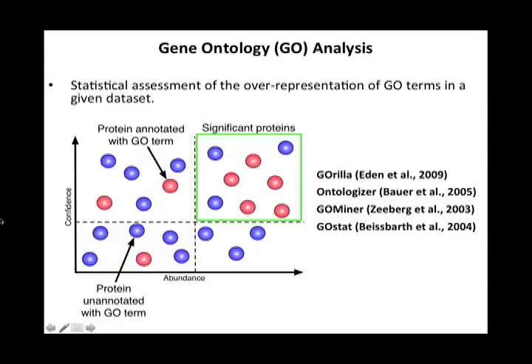Since some of you might have missed or might not remember everything regarding PSEA-Quant, I thought I'd just do a quick background review of the idea behind PSEA-Quant. Basically, one of the typical ways that people analyze their data sets in order to do some sort of functional enrichment analysis is the traditional gene ontology analysis strategy.